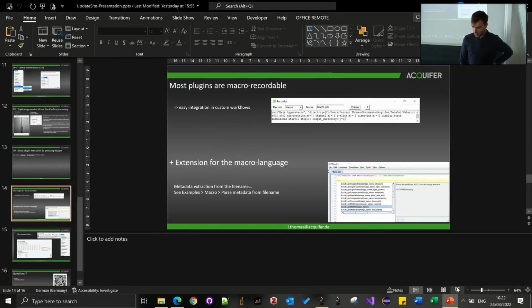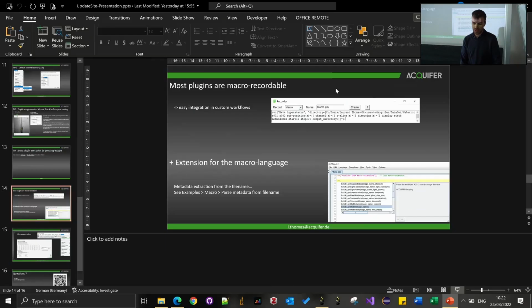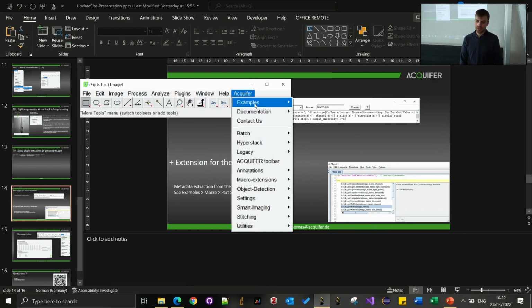Yes. So this is not a plugin, but the idea would be the same. You get a rather long command. But what would be important for you if you want to crop another dataset is to change this directory variable. So it's working like the other macro recording thingy. You have to do this kind of string sticking together or concatenation. And the rest would be pretty similar. The ROI path would not change. And that's it.